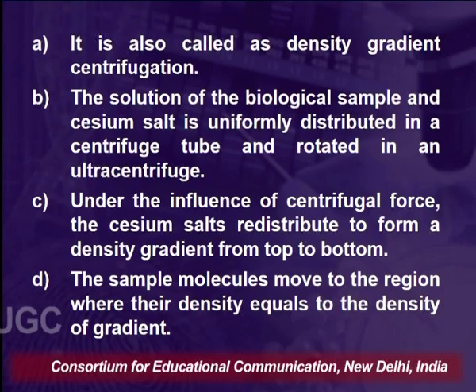The solution of the biological sample and cesium salt is uniformly distributed and rotated in an ultracentrifuge. Under the influence of the centrifugal force, the cesium salts redistribute to form a density gradient and the sample molecules move to the region where their density equals the density of the gradient.